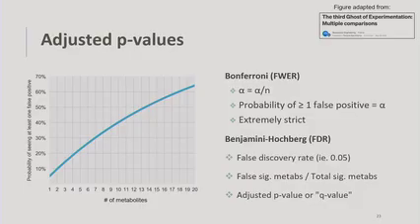That if you have 1,000 significant metabolites, 5% of those we expect to be false positives after we do the correction. And this kind of gets a nice balance between not throwing out too many true positives without just completely looking at noise. This will be called the FDR or the adjusted p-value or the q-value, depending where you see it, but those are all the same thing.